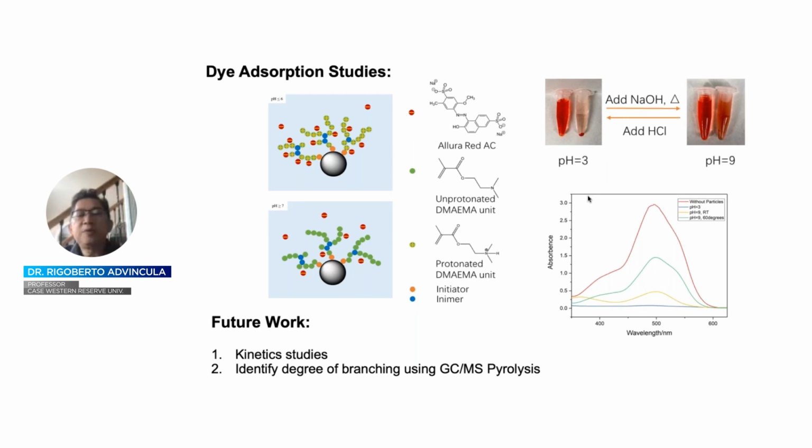So hopefully I've shown you the possibilities for flow polymerization setup. Reactions done under these conditions will give you control, or unprecedented control, on the products, the yield, the sequence, the grafting, as simple as controlling the flow rate, or in the future, in the case of controlled process parameters that include temperature, pressure, or mixing ratios, one is able to continuously produce polymers or materials in this manner.